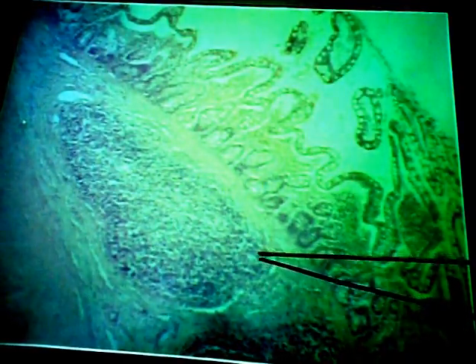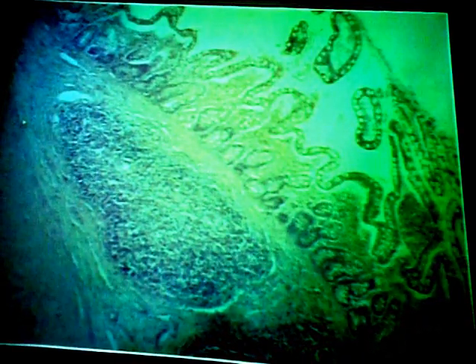What I want you to identify here are these collections of lymphocytes. You see right here, it looks like kind of a purple granular area. This is in the mucosa, the lining of the small intestine. What do we call these? Peyer's patches. Those are Peyer's patches. That's part of the MALT. Again, you should know what the MALT means. What does it mean? Mucosa, not mucus, mucosa-associated lymphatic tissue. It's collections of lymphocytes scattered around the body. And in the wall of the small intestine, they have a fancy name, they're called Peyer's patches. And that's what these are.